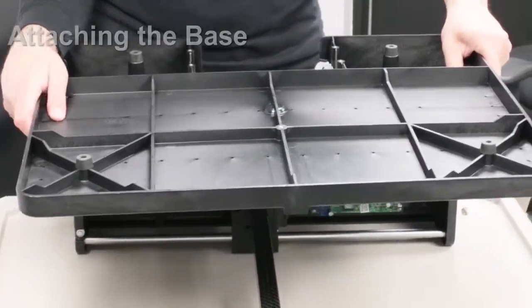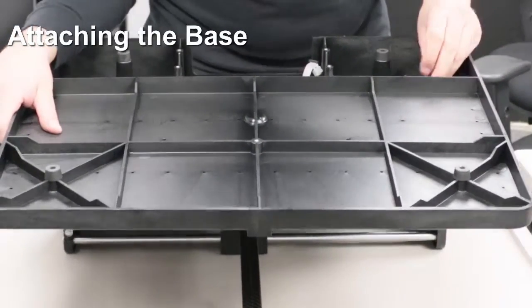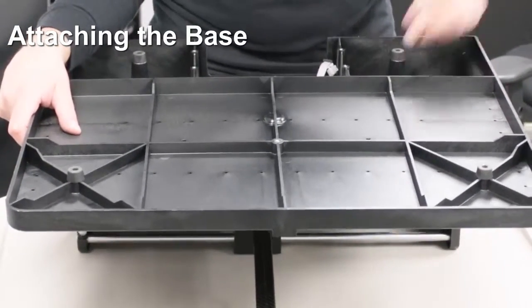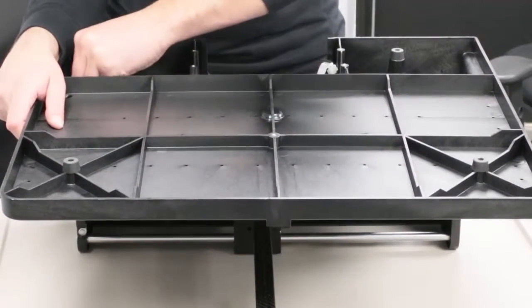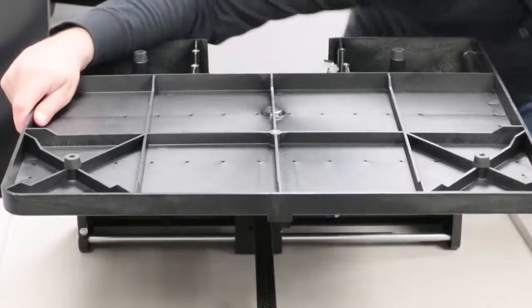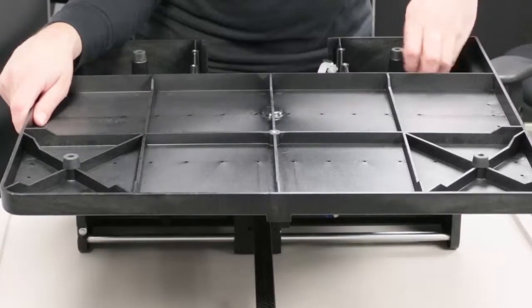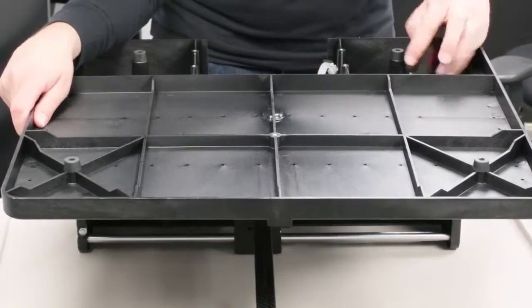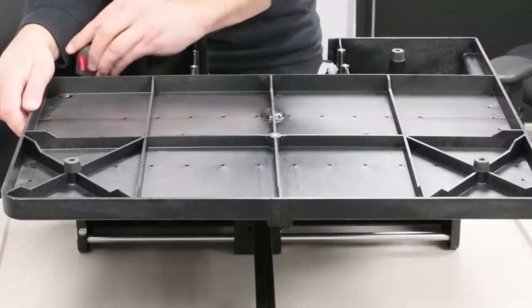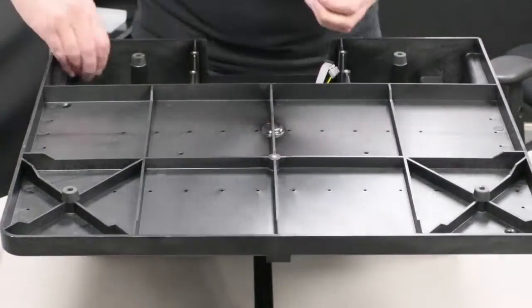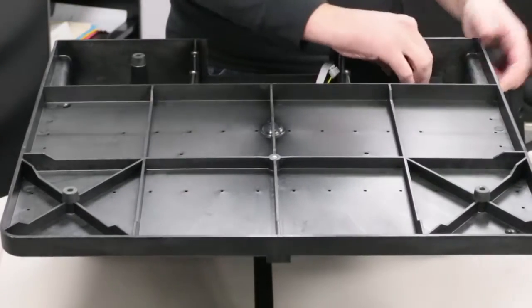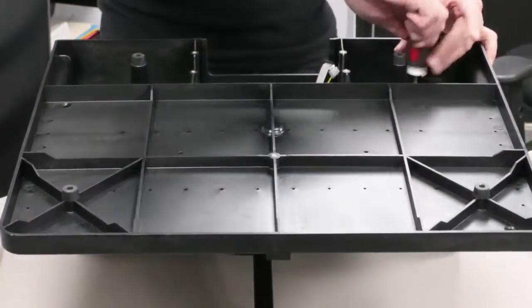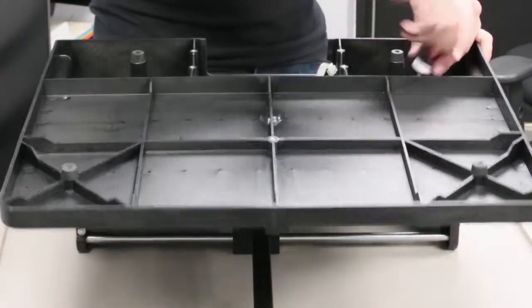Lower the base onto the autosampler. Reinstall the four screws. Make sure all four screws are tight.